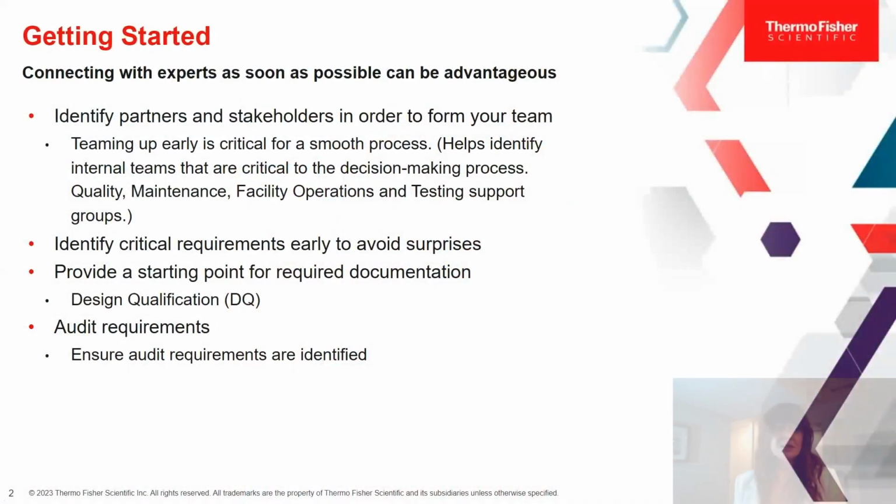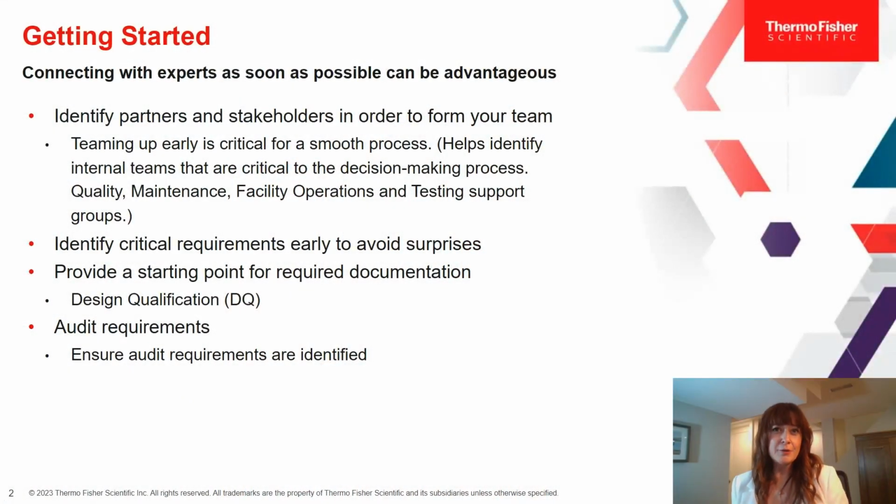Today, we're going to talk about how to choose the right cold storage for your lab. So without further ado, I'm going to jump in here. We have a special treat. We're going to combine our slide presentation with a demo using our immersive lab technology. So we will have some of our team members helping to show some of the points that we're trying to make. So what we're going to do is run through today some of the tips and tricks on, how do I choose the right cold storage product for my lab?